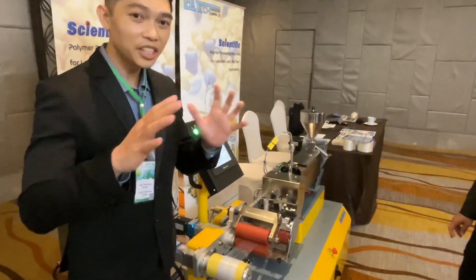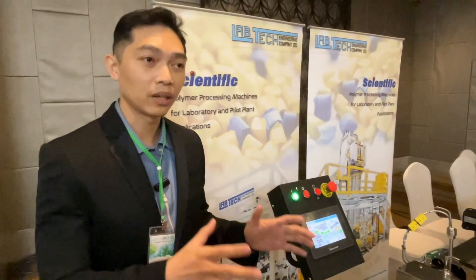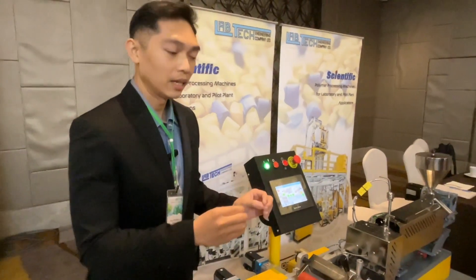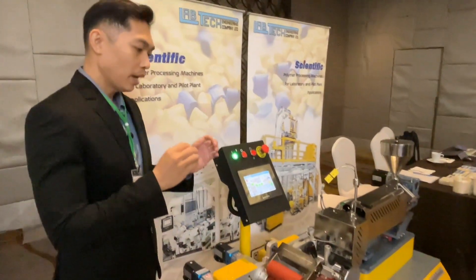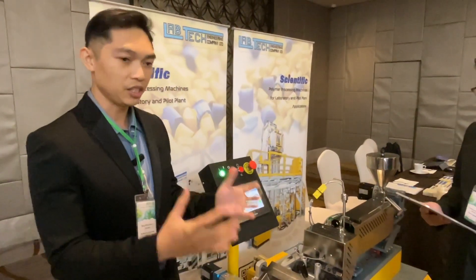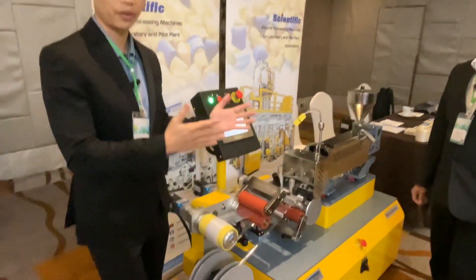So what is this machine for? We designed this machine for the people who work in the laboratory and also in the university. For example, if you want to produce a small batch of samples you will use for testing, this machine is exactly for you. We also designed this one for educational purposes, so if you want to train or teach a newcomer to use the machine before going to mass production, this machine is also for you.